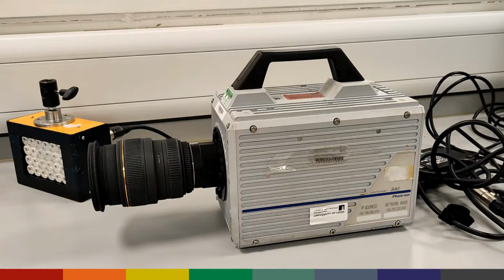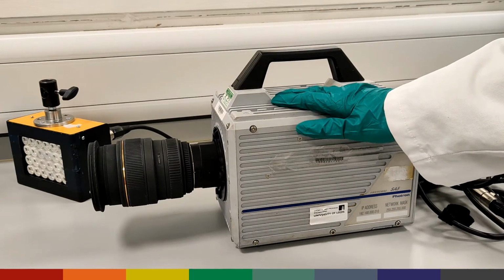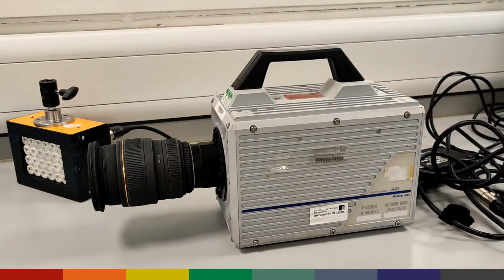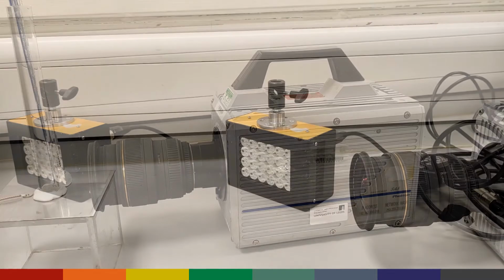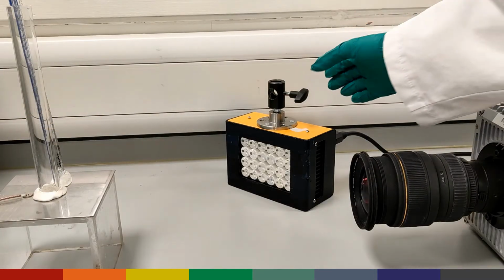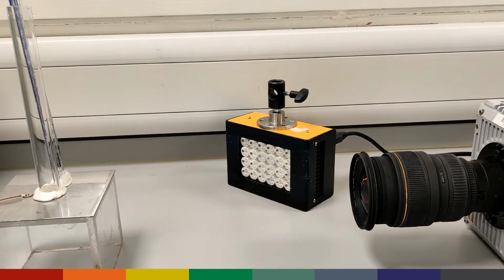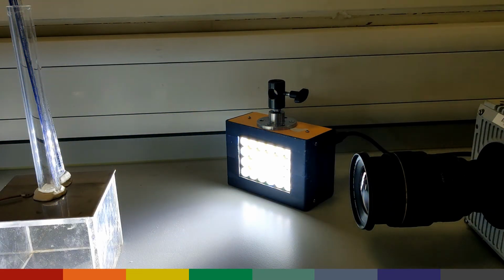What we want to do today involves a high-speed camera. The device we have here is capable of taking high-speed video up to 1 million frames per second. It is equipped with a zoom lens here. The next thing we have is a light source that is used specifically for high-speed imaging purposes. A friendly warning here, don't stare right at it when it's turned on.